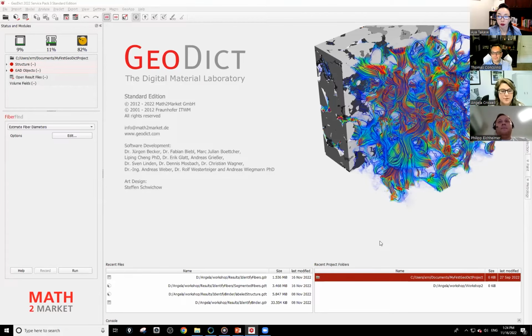Exactly. The pressure drop comes up a lot, right? So then it makes sense. If they're all straight fibers in the same direction, they're not going to catch things as well as if they're mixed orientations and such. So that makes complete sense.